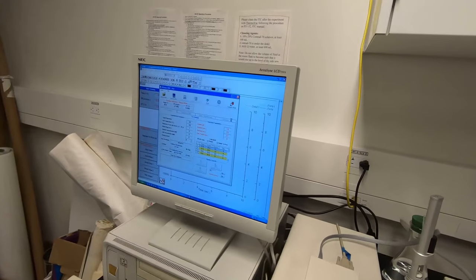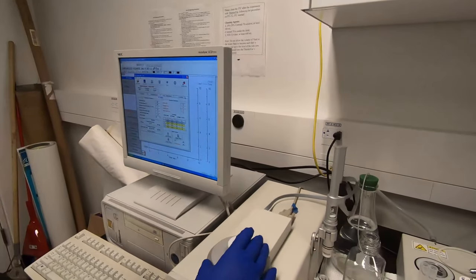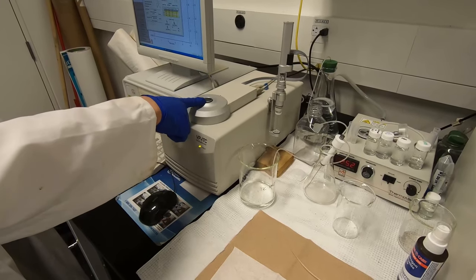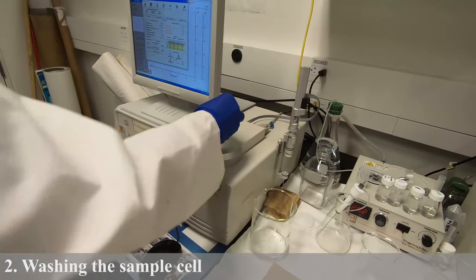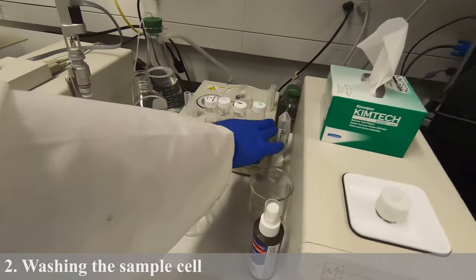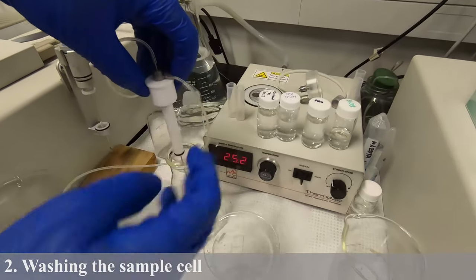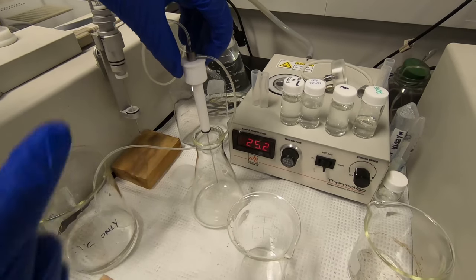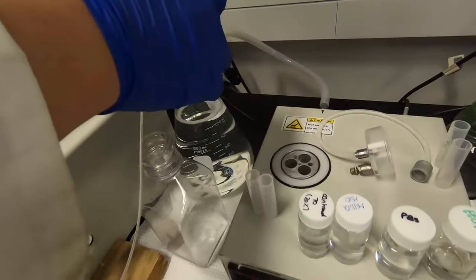Before you start a titration, the first thing you need to do is clean the ITC to make sure the sample cell and the syringe are clean. The way to clean the ITC is to use a thermal vacuum pump. This is to pump vacuum and then use a plug with a needle to flush the solution or water you want to use to wash the ITC cell, flush it into the cell and draw it into this waste container.